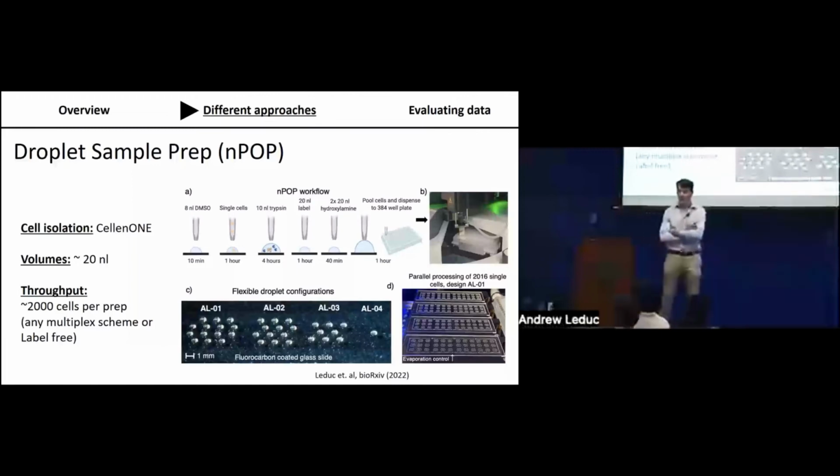Yeah, so actually the person sitting behind you is probably best posed to answer this question. We've computed the dimensionality reduction plots with minimal processing of the data. You can even do it on the raw peptide level without any of the normalization or batch corrections that we apply later downstream, or any imputation approaches. There are different sources of missingness in single cell proteomics data. For RNA sequencing, it's a bit hairy. You have technical dropouts and zeros, but they could also be due to low abundance, and it's hard to attribute which. For us, it's a bit more clear.